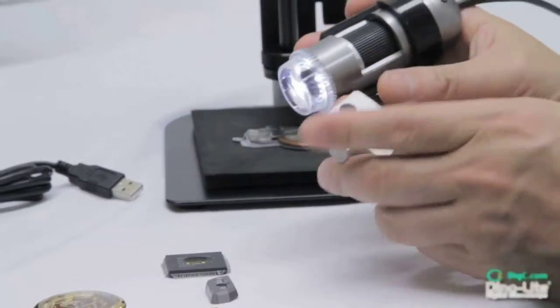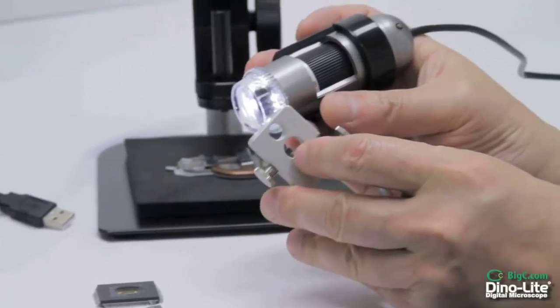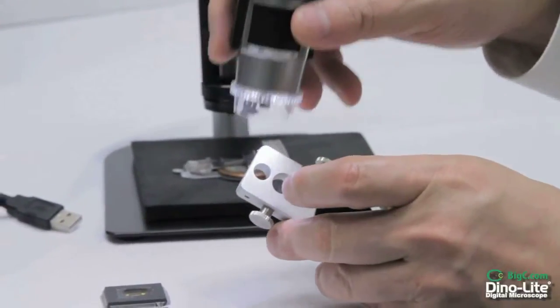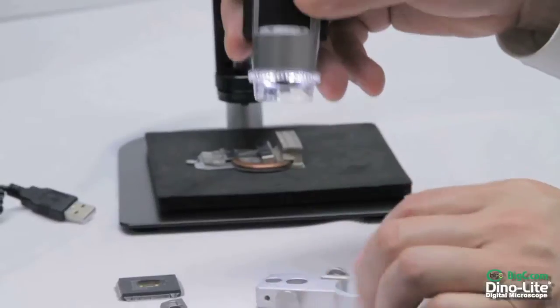This model has a shortened nozzle allowing the user to achieve 200 times magnification at a 6 millimeter working distance without touching the object.